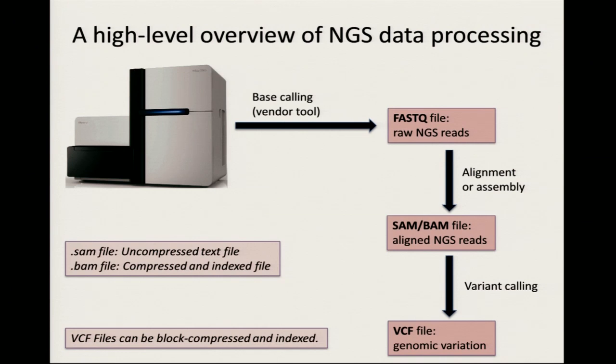So these are the three basic file types in NGS processing, and we're going to go through each one, and I'll show you what they look like. These are pretty important, actually, if you want to do this kind of stuff. Okay.